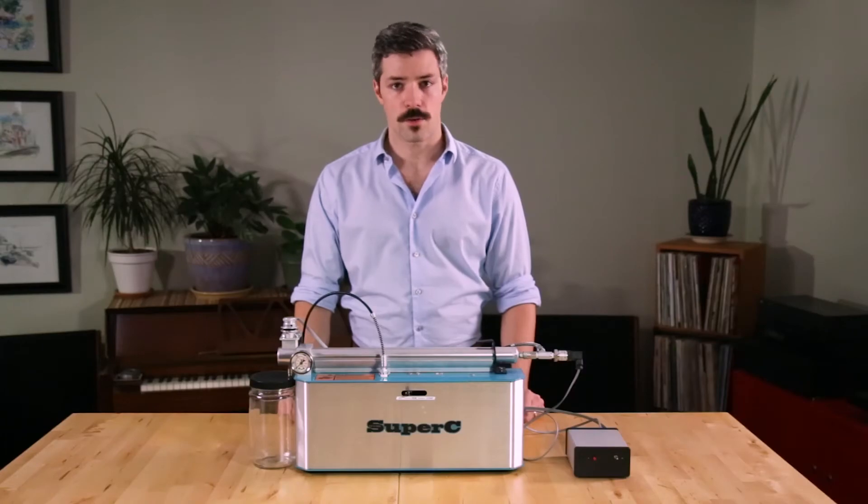This is the Super C Extractor by OCO Labs. I'm Chris with OCO Labs, and in this video we'll be discussing some of the specifications, new features, and operating parameters of the equipment.